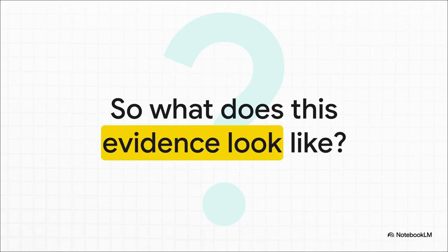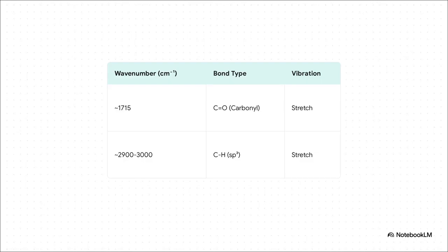It's this incredibly rich, detailed graph that is just loaded with all the clues we need to start cracking the case of our unknown molecule. What we get is this thing called a spectrum. Now, along the bottom, you've got this number. It's called the wave number, but really it's just a way of measuring the frequency of the light. And all those big dips, or peaks depending on how you plot it, they show us exactly where the molecule absorbed the light.